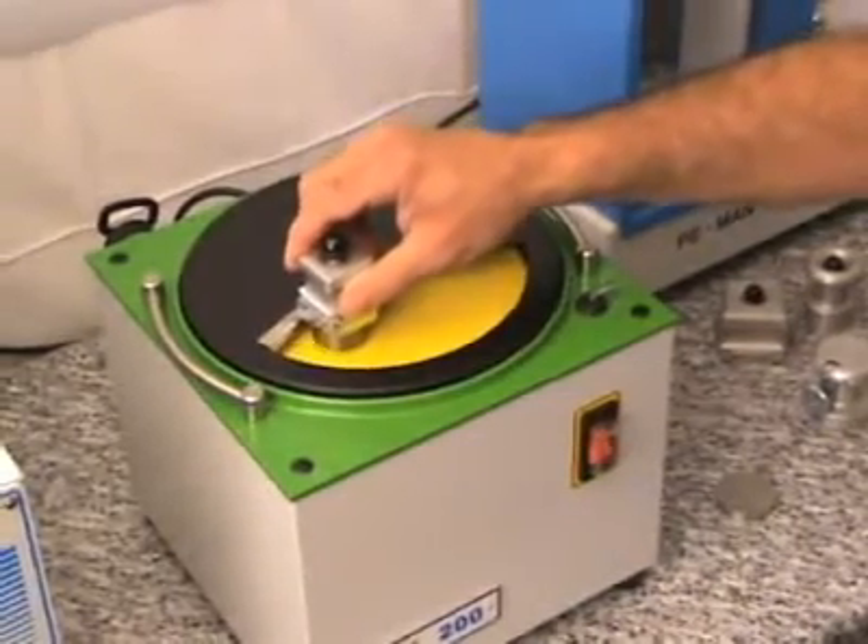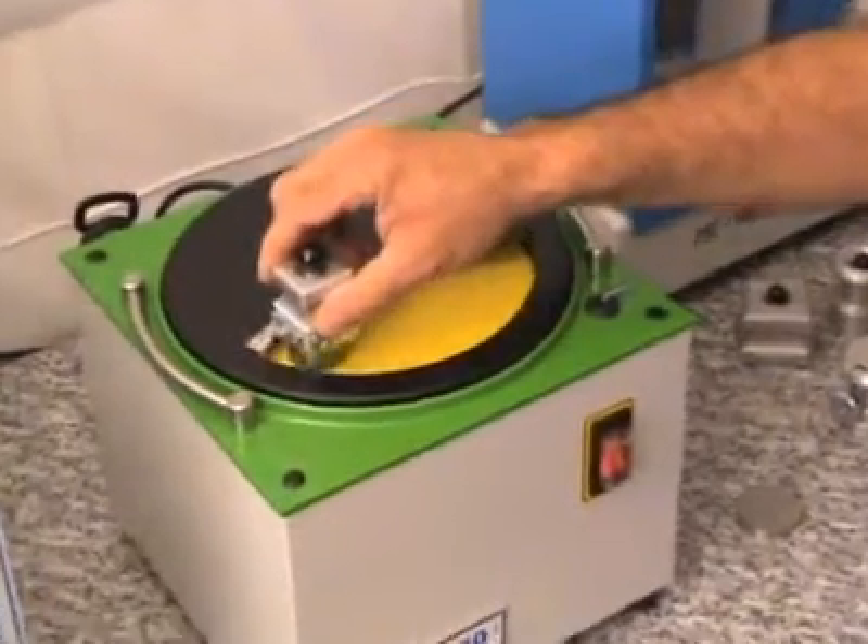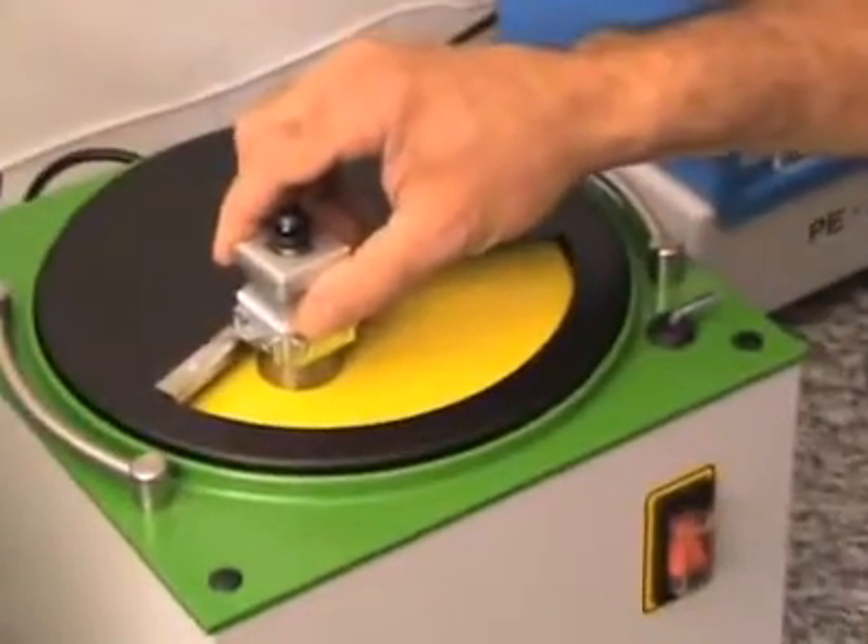There is no dust exhaust installed now, and therefore you can see some glowing sparks from grinding.